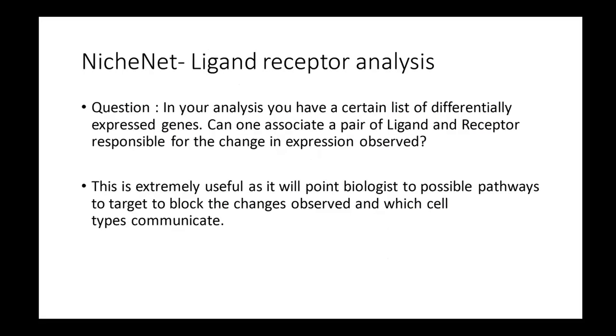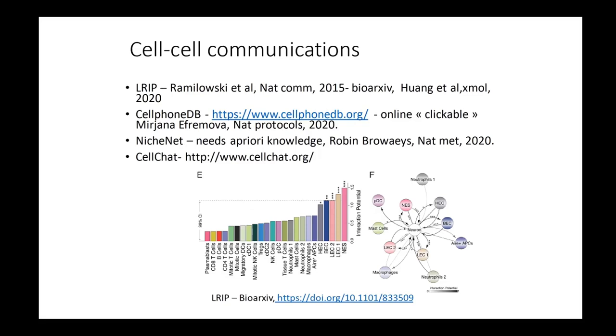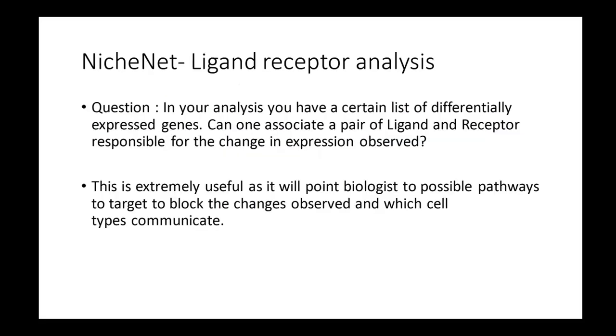So NicheNet works quite differently, and I would like to mention how it works. You need to have some prior knowledge, and we will explain how. And the idea of NicheNet is the following.